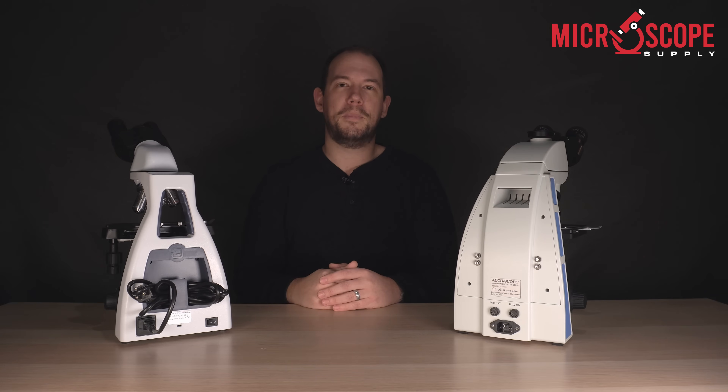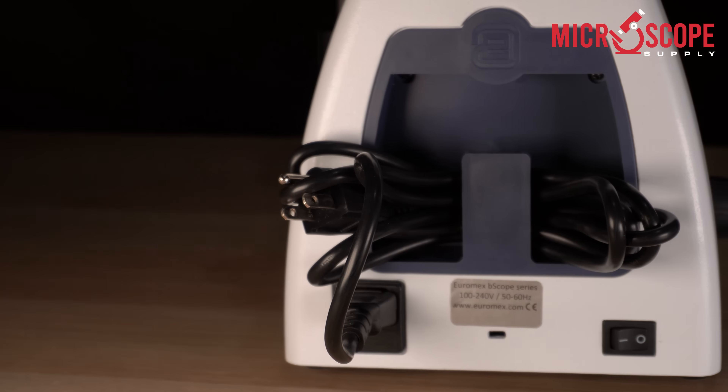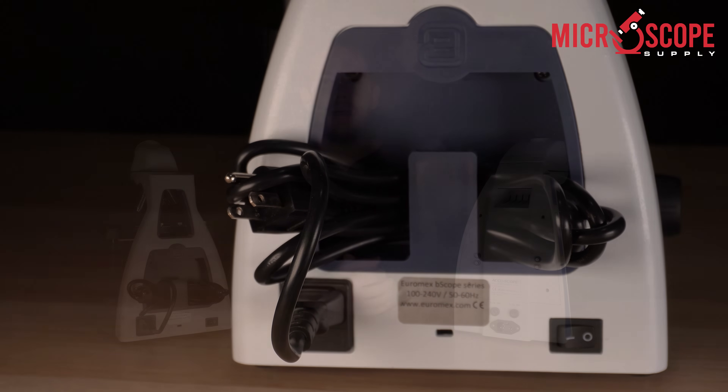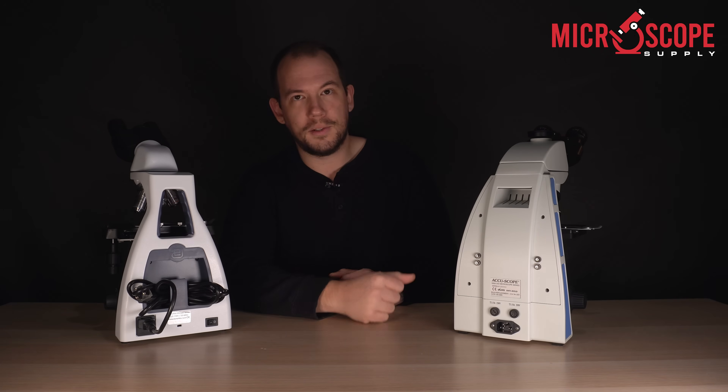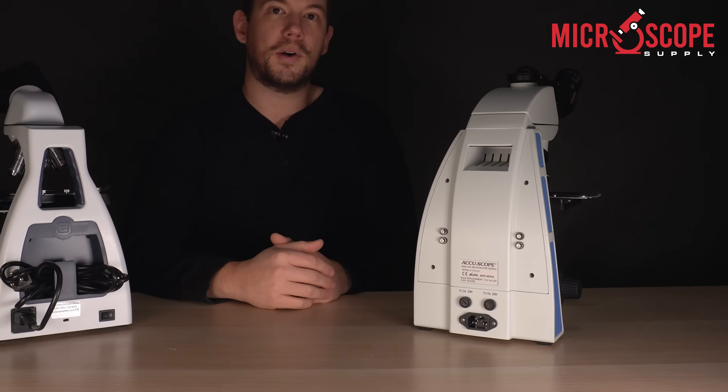Some microscopes come with built-in cord storage, like the Euromax B-scope — you can see we have cord storage integrated into the frame itself. Some microscopes have cord storage options, like the Accuscope 3000 LED — you can see we have four screws here that allow you to put on cord hangers to wrap the cord around the back.